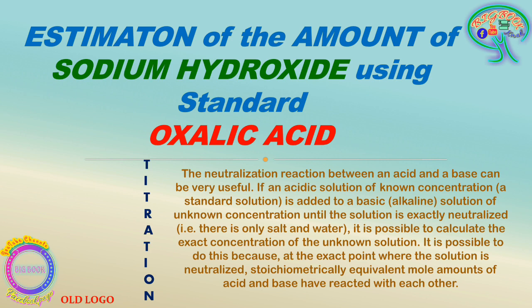As per this definition, acid and the base are the two substances, or the reactants, which are going to take part in the titration method. Here it is a titration method because one substance out of the two reactants is going to stay as the unknown by its mass and also its normality.